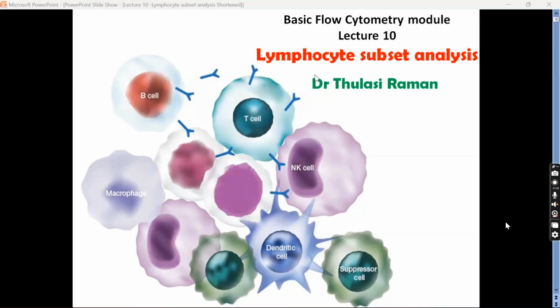So today we'll be discussing lymphocyte subset analysis, and I'll show you some live analysis of basic lymphocyte subset analysis and some extended lymphocyte subset analysis. I'll tell you what is the difference between a basic lymphocyte subset analysis and an extended one during the course of this lecture, and this is the penultimate lecture. So post this lecture we'll have an assessment.